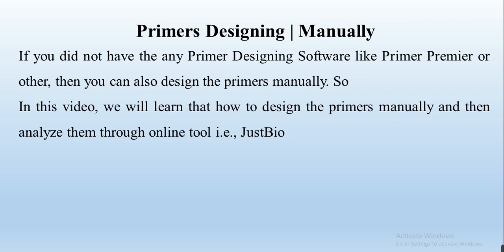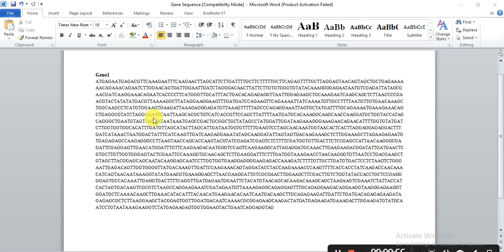Through this online tool we can analyze what is the melting temperature of this primer, what is the length of the primer, and what are the GC content, etc. So how to do, let's start. So this is my gene and I want to design the primer of these sense and antisense primers or forward or reverse primer to clone it.